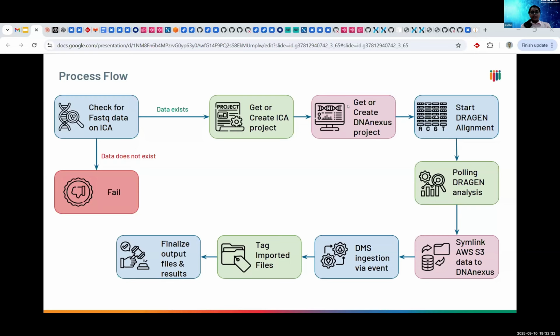And symlinking is a new feature put out by DNAnexus. It enables us to link any external data on S3 or any other such places and store them as objects on the DNAnexus platform. So this is the DX storage 2.0 that even Benjamin has been mentioning.